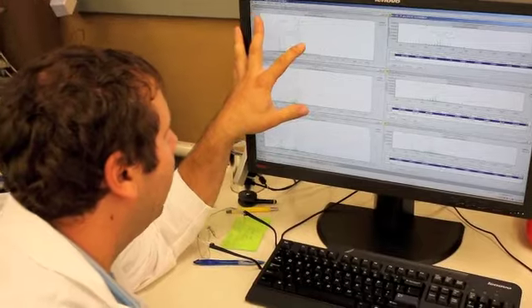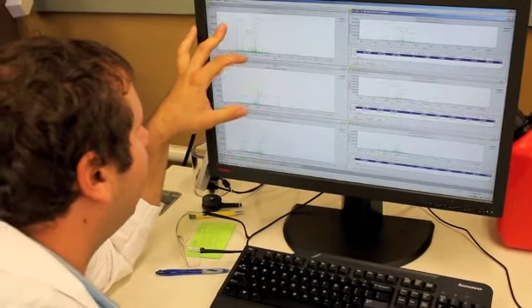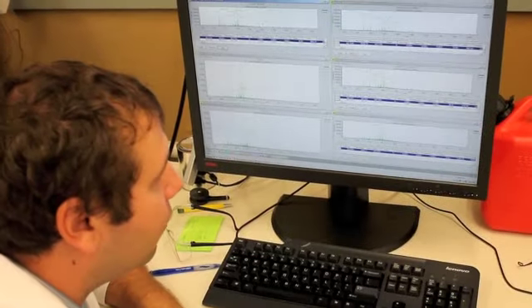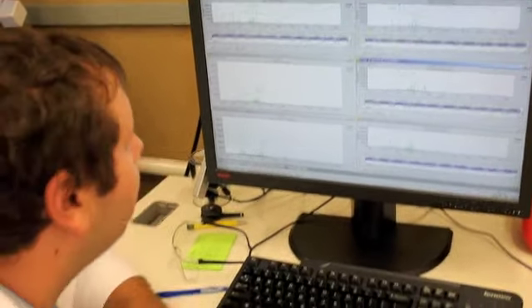The ones on the left are the controls, and the ones on the right are the mysteries. So, like the Giant brand is going to have this 404 at similar height to this 395, and it's also going to have the 422 as one of the taller peaks. So I'm trying to figure out which one could possibly be which, based on the different ratios and all that other fun and exciting stuff.